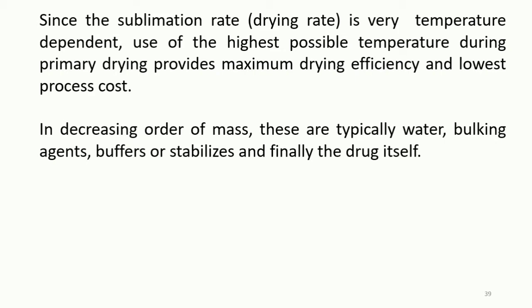This structure manifests itself in the form of transitions that occur at specific temperatures. Physical properties of the bulking agent, such as modulus or viscosity, can change by orders of magnitude depending on whether the process temperature is a few degrees above or below the transition temperature.